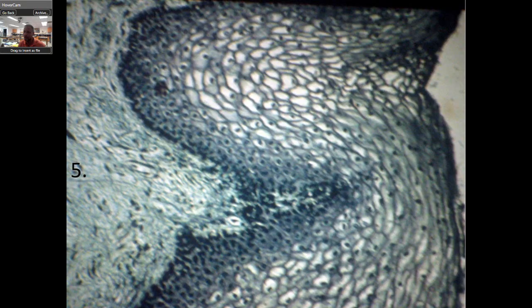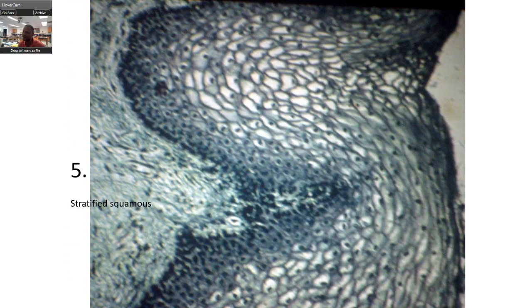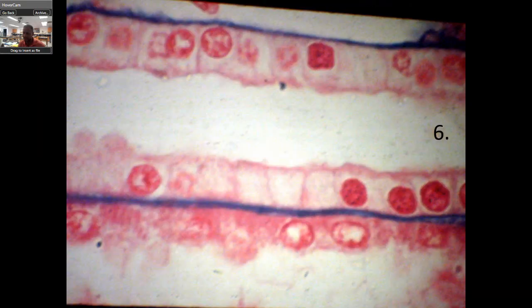This should be stratified squamous. And that's what I'm going to do for the rest of these slides — advance, show you a picture, and show you the answer. The purpose of this is a quick review, so I'm not going to do much elaboration.